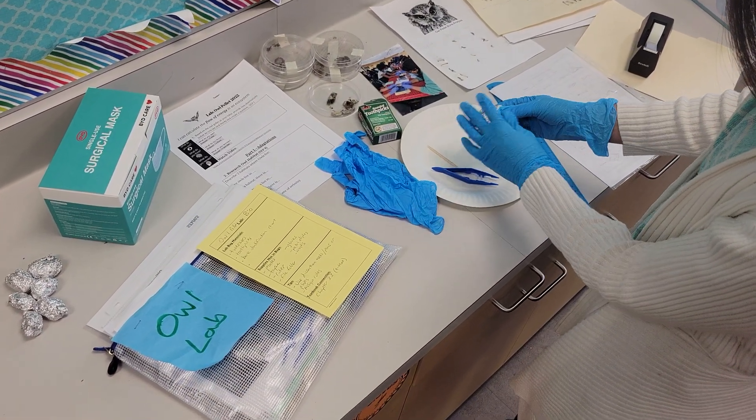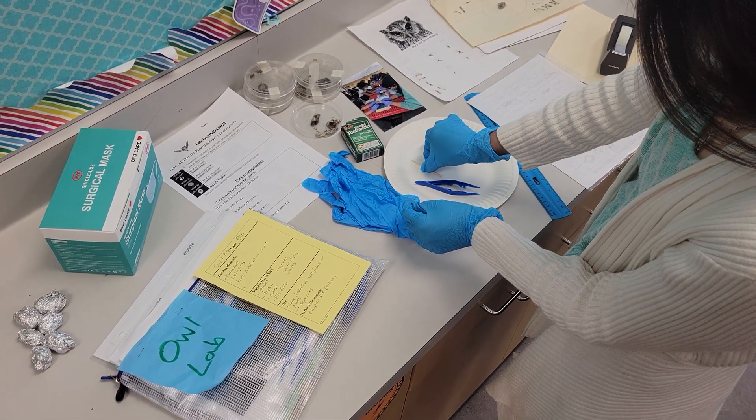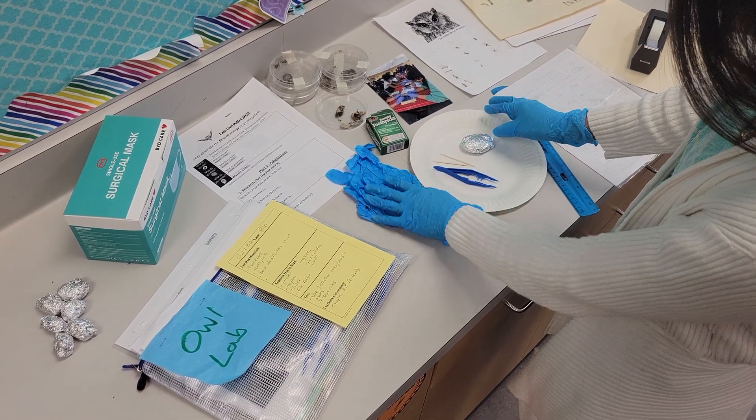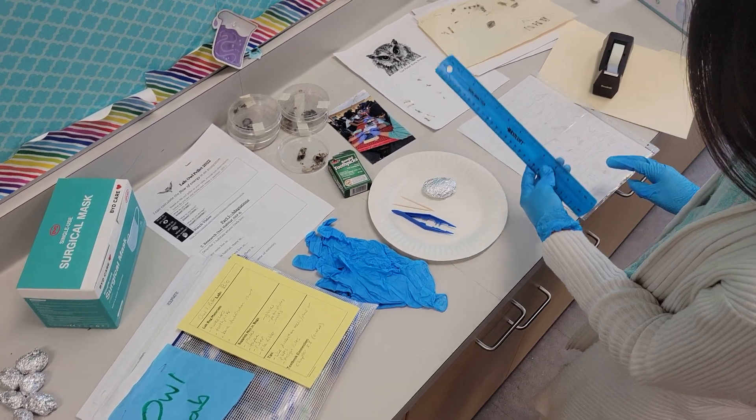The owl pellets are already sterilized and wrapped in foil. If you don't have any dissection tools, toothpicks or forceps work perfectly fine, or students can just use their hands. You want to provide gloves for the students and a ruler to measure.